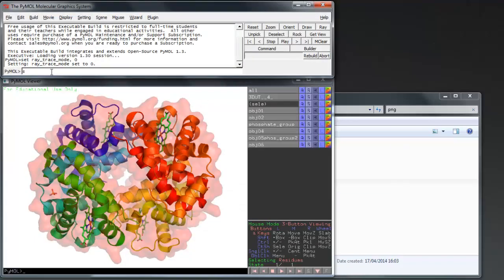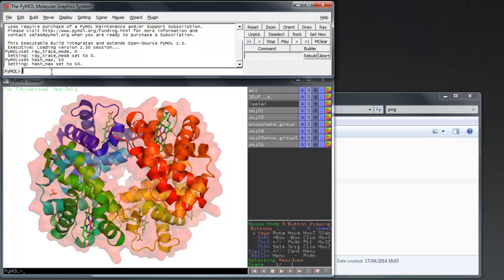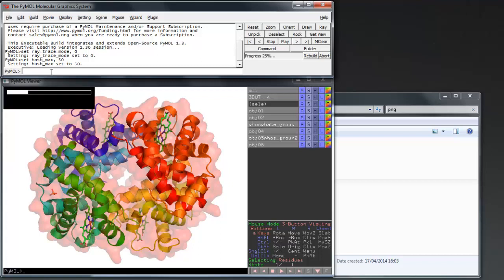If your PC is low on RAM, try reducing the memory available through the command set hash max 50. Similarly, the available memory can be increased past the default 100 megabytes by entering set hash max 200, but will obviously require a more powerful PC.